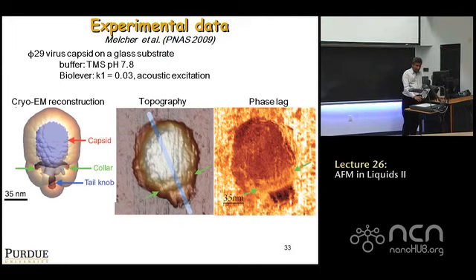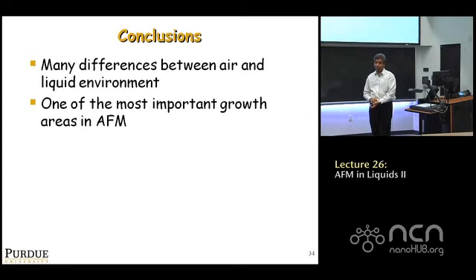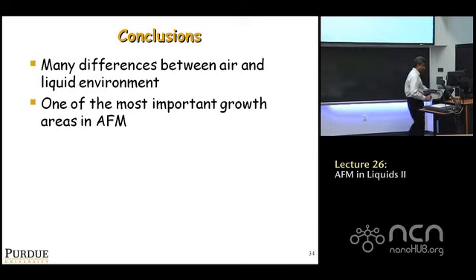So in conclusion, we've tried to highlight many differences between air and liquid environment. It's definitely one of the growing areas, and there's many things that are not understood yet. So I will move on now to talking a little bit about some new developments in AFM, which are the next set of slides that are given to you.